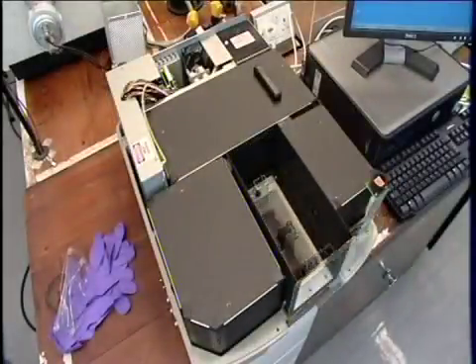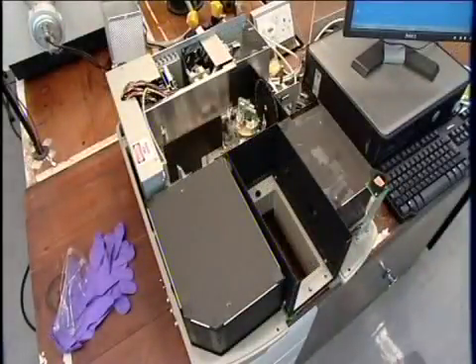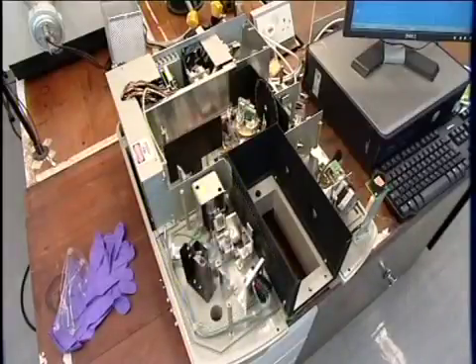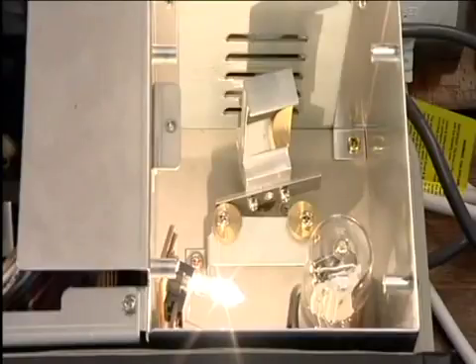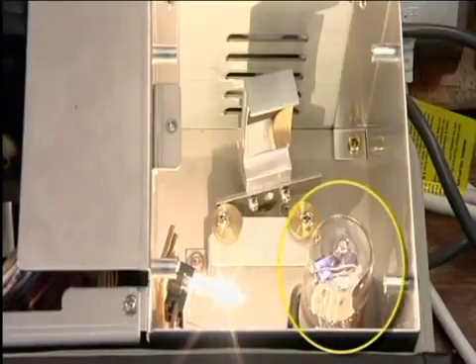Inside a UV visible spectrometer, there are usually two light sources, one giving out visible light and one ultraviolet. This one is a tungsten lamp, like a car headlamp bulb, for the visible region. And this deuterium lamp gives out ultraviolet.